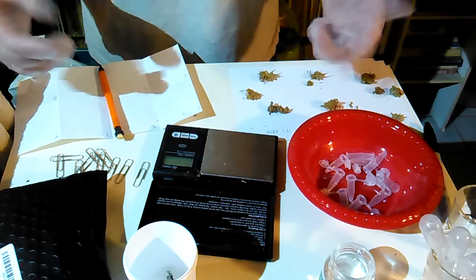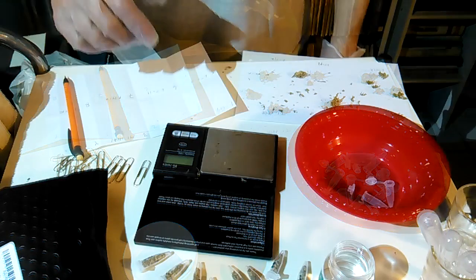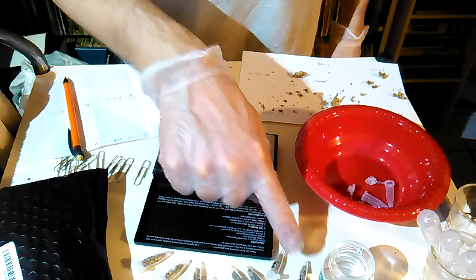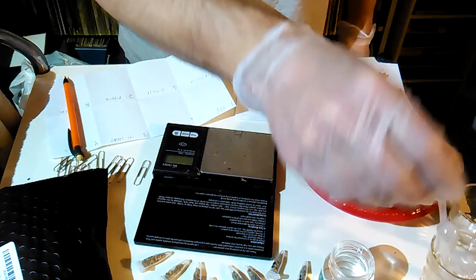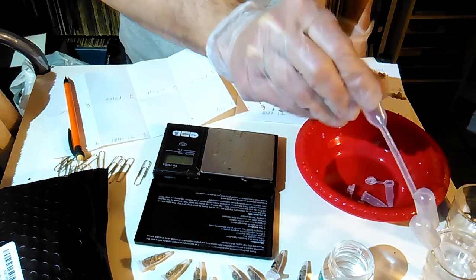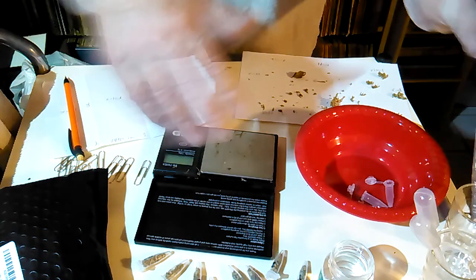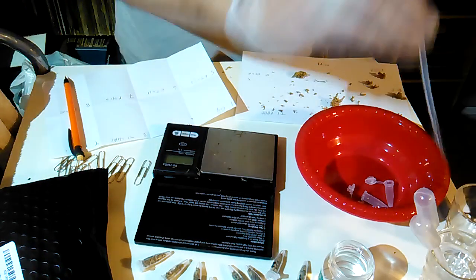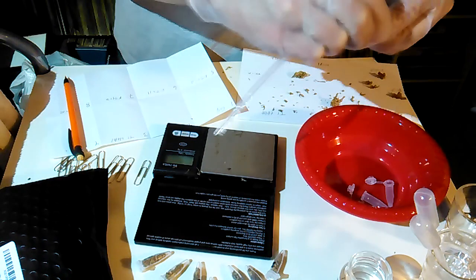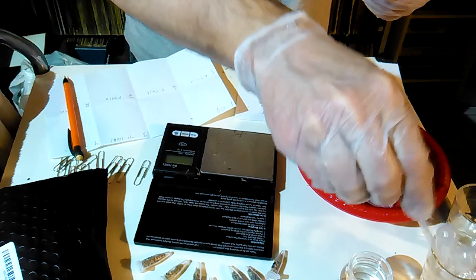So I'll just save the time for the video and skip to the next part. Next step is adding the alcohol into the tubes. So I actually put these in order. I wrote with the Sharpie, but one thing to be careful about is that Sharpie sometimes rubs off. So the best thing is to put them in some type of order. If you have a rack, that helps, but whatever. So number 1 here, they should each get, so I got this shot glass full of rubbing alcohol.